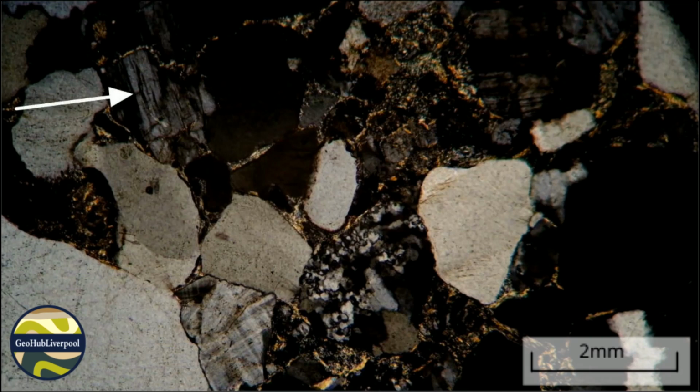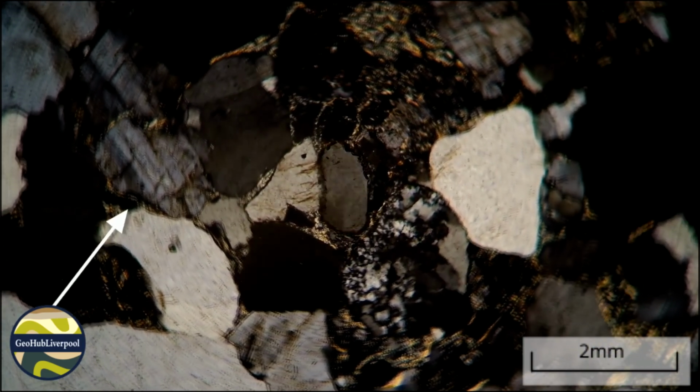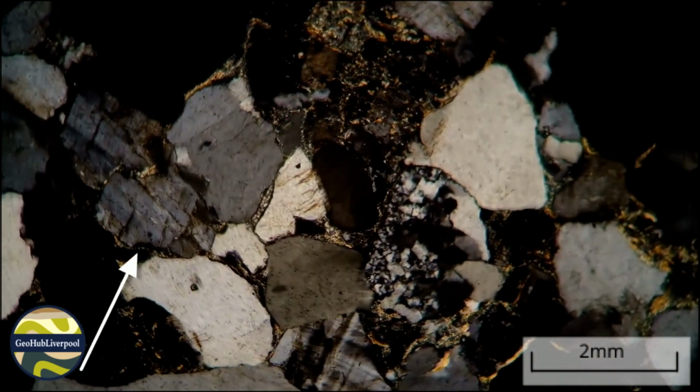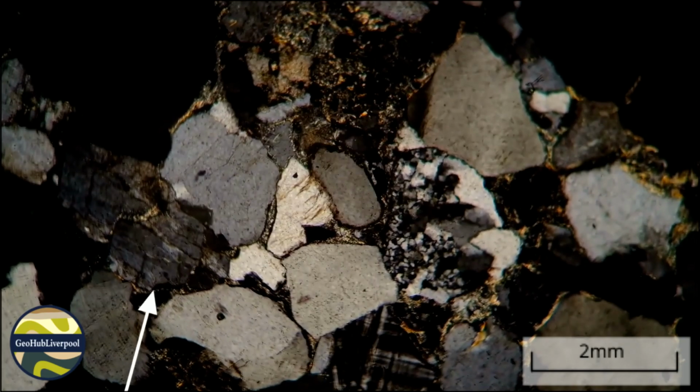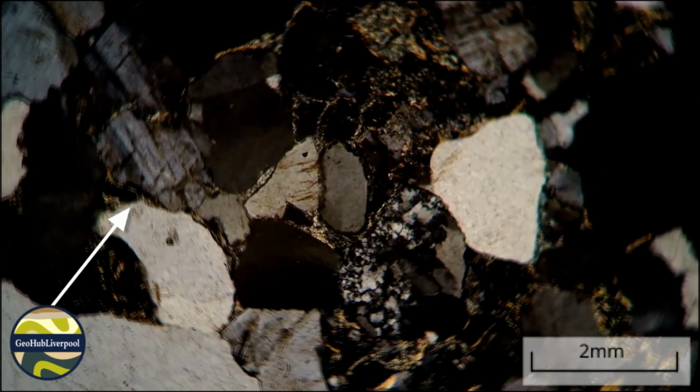Feldspars may show multiple or lamellar twinning. This is plagioclase feldspar. Rotation of the stage in one direction results in the sets of lamellae going dark and reaching extinction. Rotation in the other direction results in alternate lamellae reaching their extinction position.